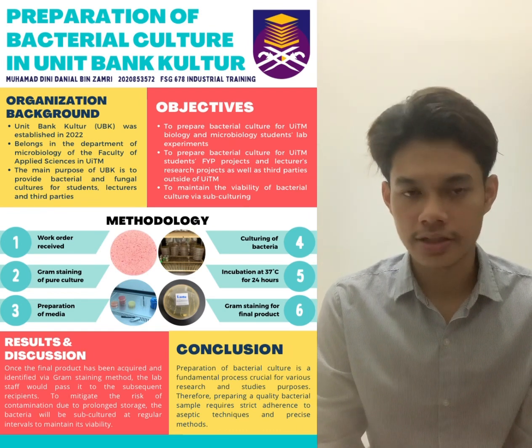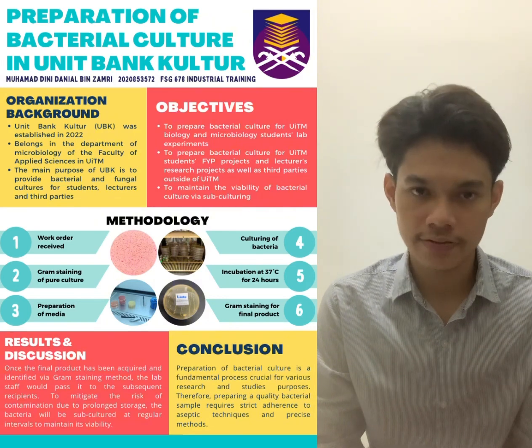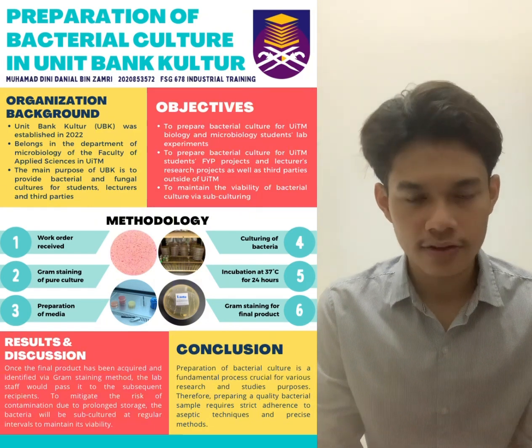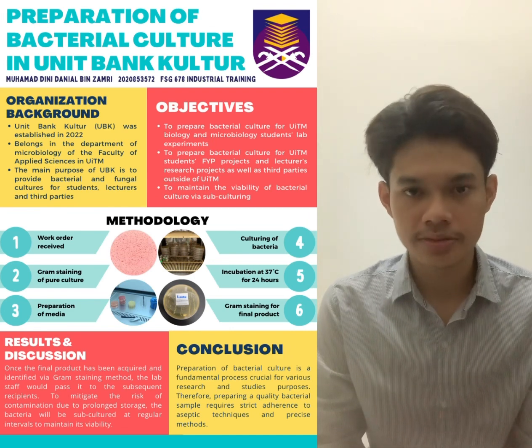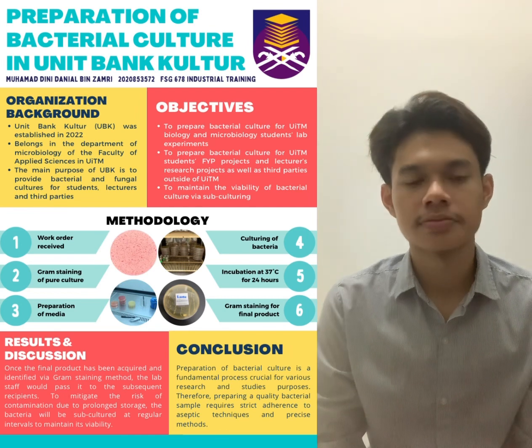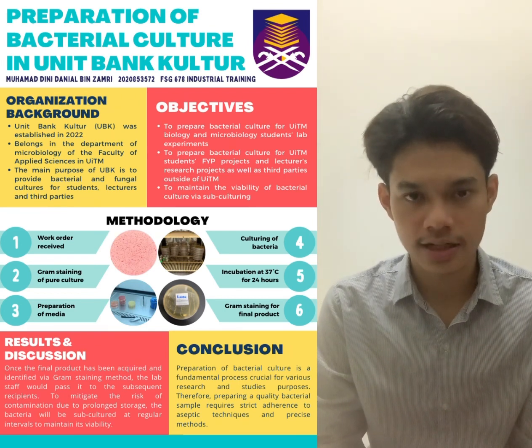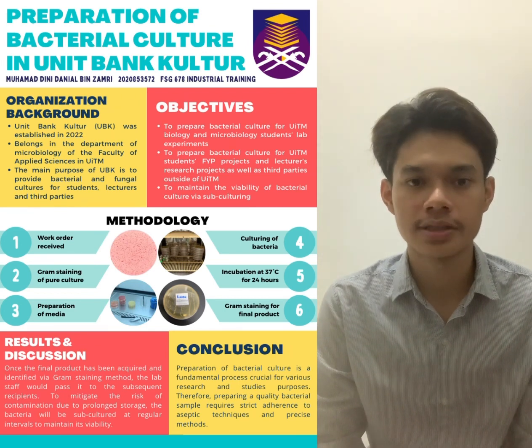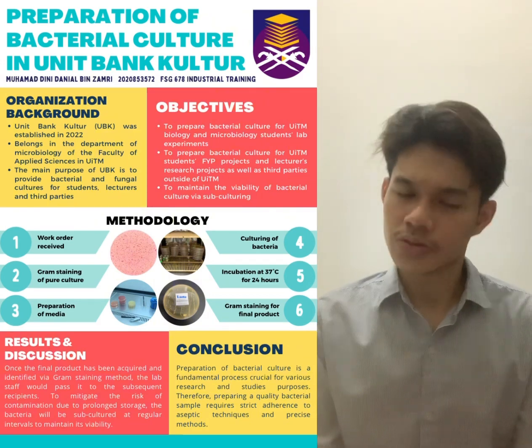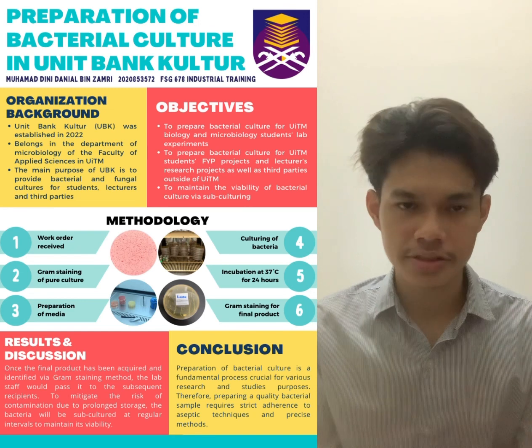After that, I incubate the bacteria at 37 degrees Celsius for 24 hours. After the incubation period, I gram stain the bacteria once again to make sure that it is the right species. If I fail to identify and isolate the right species, I would have to start again from the beginning. Next, we will move on to results and discussion.